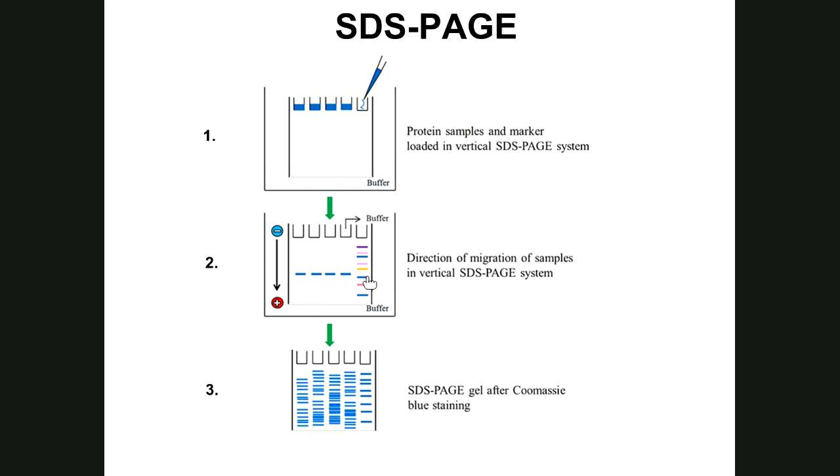Now what will happen is once the tracking dye has migrated far enough down the gel, and usually you're given that information, or it's through trial and error that you figure it out, you would stop the electrophoresis process and remove the gel. You would then add it to a container with the Coomassie Blue solution, allow this Coomassie Blue to stain the gel, and rinse the gel to get any Coomassie Blue stain that's attached to the polyacrylamide off. Now you go from what looked like this during the electrophoresis process, where you could only see your tracking dyes and the pre-stained protein marker, to where now you can see where the Coomassie Blue has attached itself to all the protein samples in your gel. Now this is the way it works.